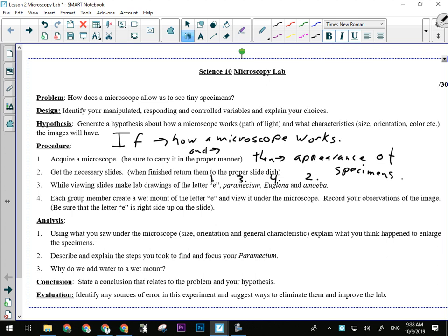The problem with it is this. Right now, I'm looking at Colton. Colton is in focus, Elise is not. That's the way the human eye works. If I focus here, everything behind the depth that I'm looking at looks out of focus. The same thing will happen with the amoeba on high power. You'll get the closest part in focus, and the rest of it behind will be out of focus, and you have to focus through. It's hard to get a good picture of it when half of it is out of focus. So you want to take a picture of it on the low power lens because you'll see the whole thing and be able to get the whole thing in focus.